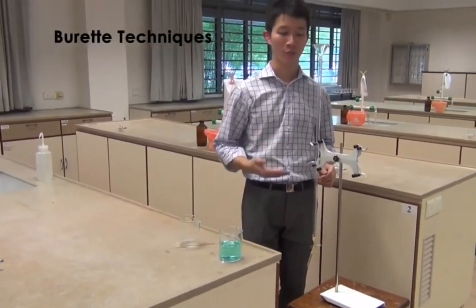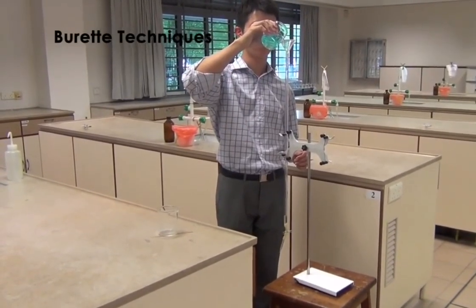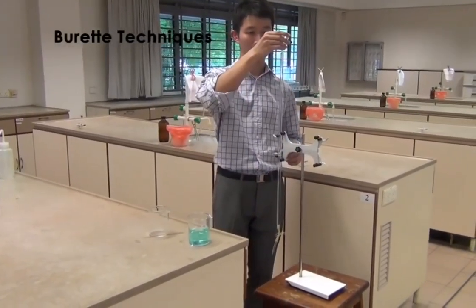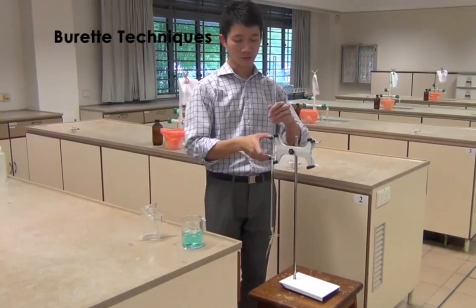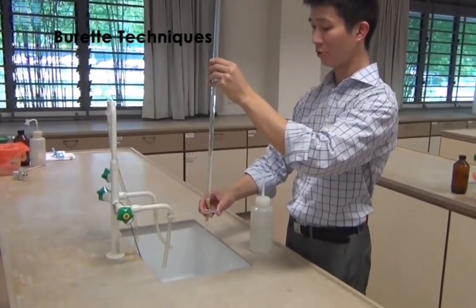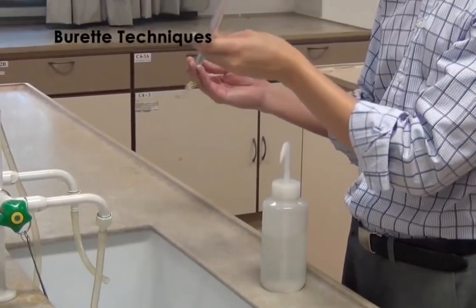Now, you may begin to rinse the burette with your solution that you are going to fill the burette with. Fill the burette with about half of the solution. Next, bring the burette to the basin. Open the clip to allow the solution to run through the tip of the burette. Once that is done, rinse the top of the burette.